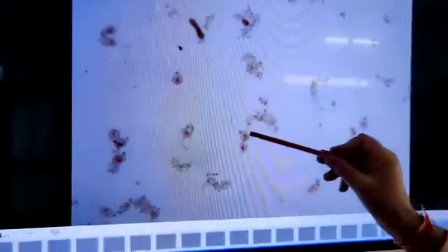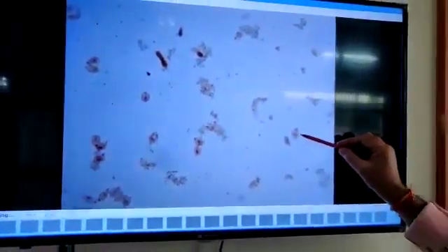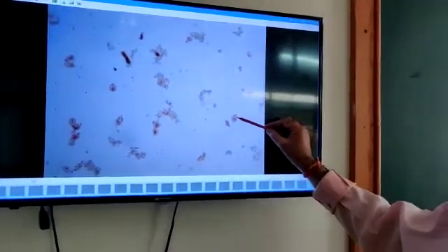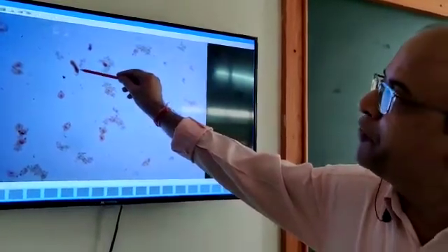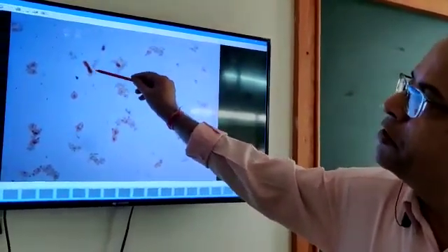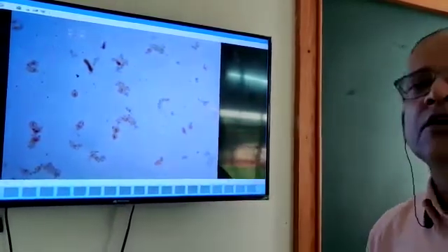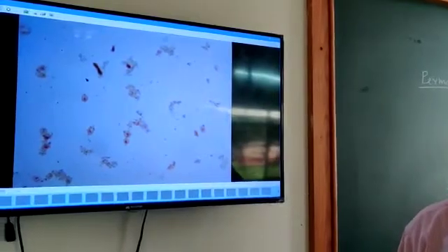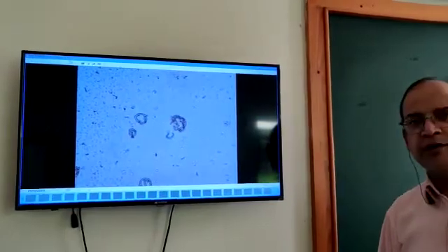In this Entamoeba histolytica, you can see the nucleus also. This central part is the nucleus, and here you can see the process of binary fission — one cell is splitting into two Entamoeba histolytica, causing the disease dysentery in human beings.